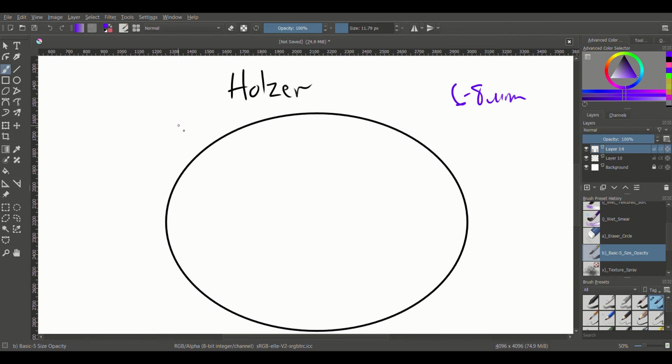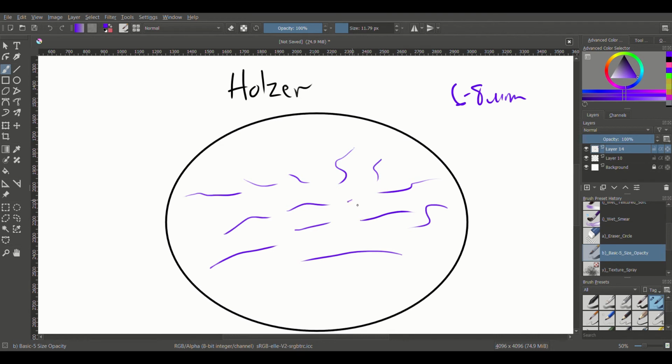And our differentiating solution has chloroform and aniline oil, both of which are pretty dangerous. The thresholds for exposure are very low. Everything has to be done in a hood. So you have to be super careful when you do this. But when you're all done, all of your glial fibers should show up as kind of a deep blue color. And it's more selective than our last one.